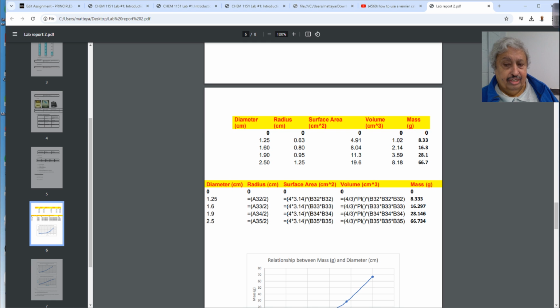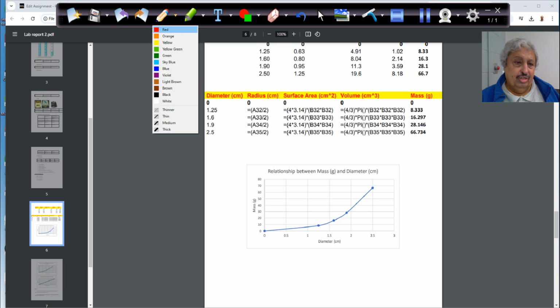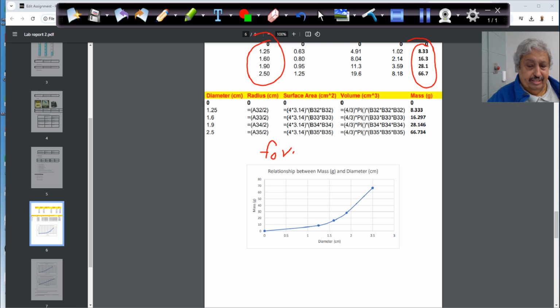We'll do it through Excel. So you have the mass here. You measure the mass, correct? That's what you are measuring here. That's the mass here. 0, 0 is one part of this. That's the mass and that's the diameter. Okay, guys? If you have a mass and diameter, you put the formula for that. The formula is given to you here.